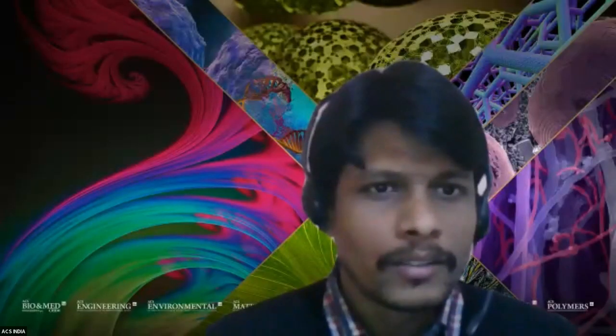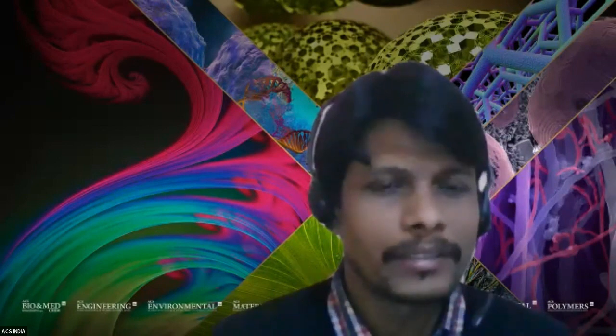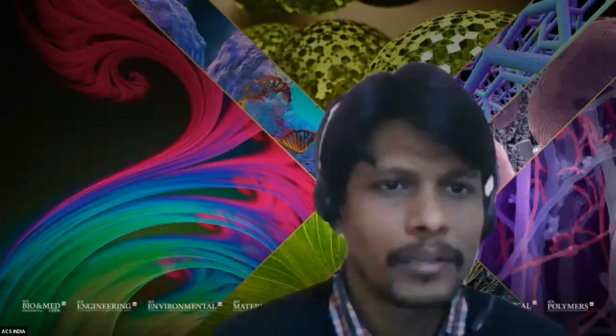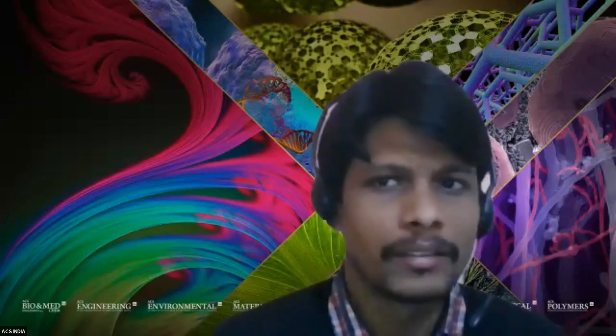Thank you. We have a question around the second project that you discussed. Is it possible to discriminate two samples if there are multiple mutations against a single mutation? No, unless the secondary structure change is sufficiently large. If the mutation is only at one particular site and it doesn't affect the secondary or tertiary structures, then we may not be able to see it. What we are seeing in most of our protein studies is related to secondary structure. Primary structural changes we cannot see in proteins. We can see the tertiary structure changes as well.